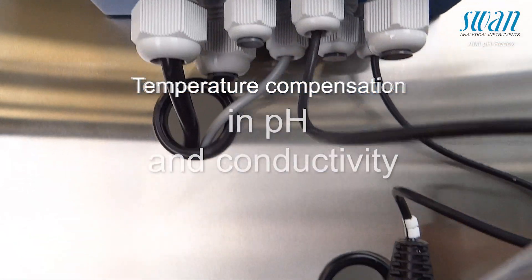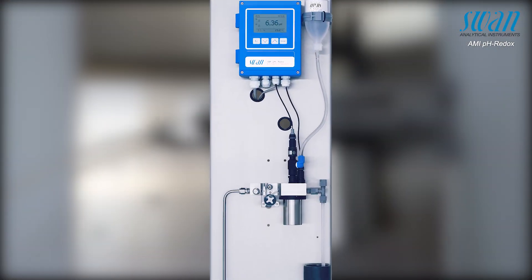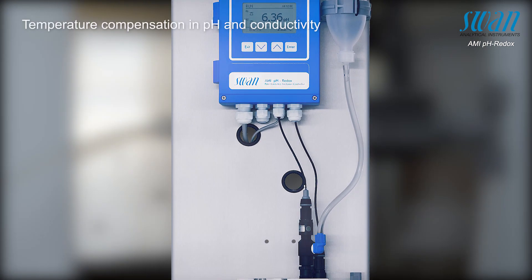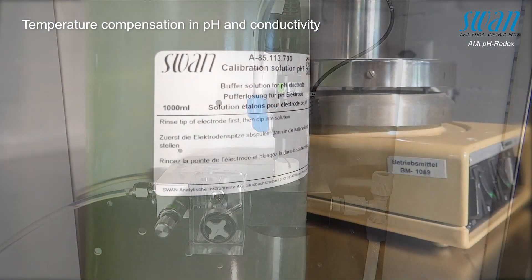SWAN's AMI PH instrument has an integrated temperature compensation allowing it to display the measured pH value as if it is measured at 25 degrees Celsius. To perform this compensation, it is necessary to accurately and precisely measure the temperature changes of the buffer as well as the pH value.